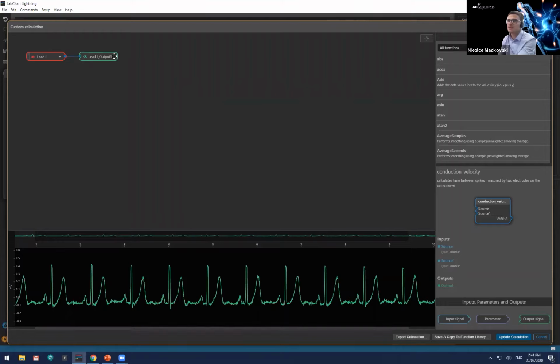Anytime I see the forward arrows, I'm going to left click down and bring this across like that. You'll see a line is just connecting these two. This tells me that this is the connection, but I have no calculation at the moment. Now all I have to do is minus these.